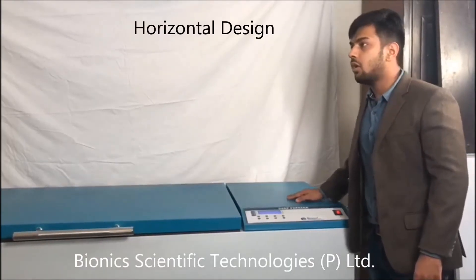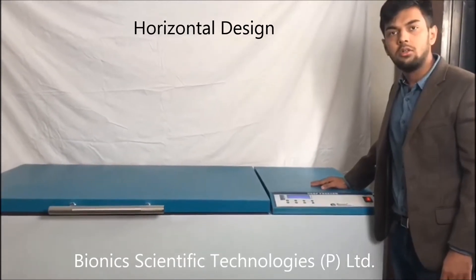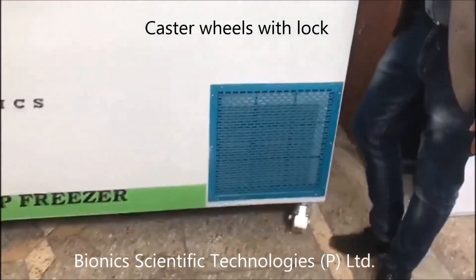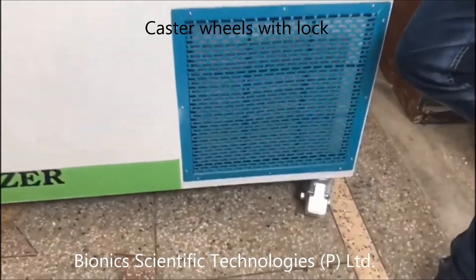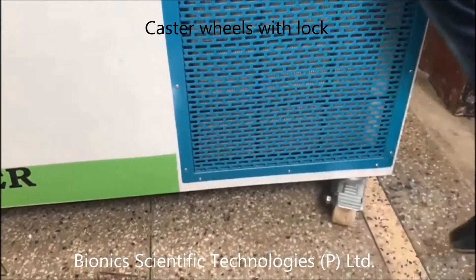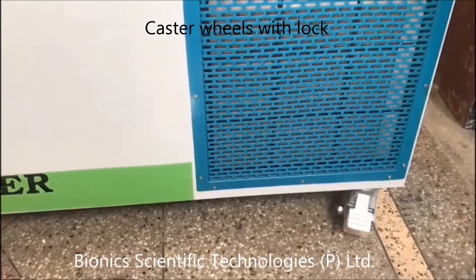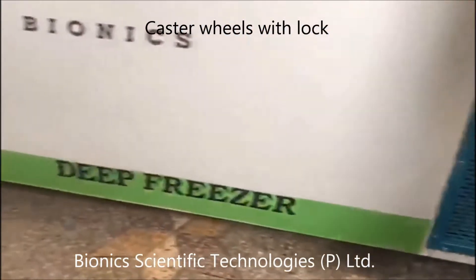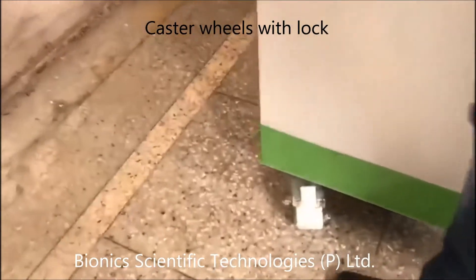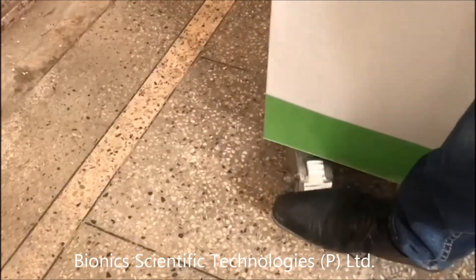The design of this deep freezer is horizontal. We have caster wheels — as you can see they are locked right now. We can unlock it like this and lock it like this, and the same with the other wheel.